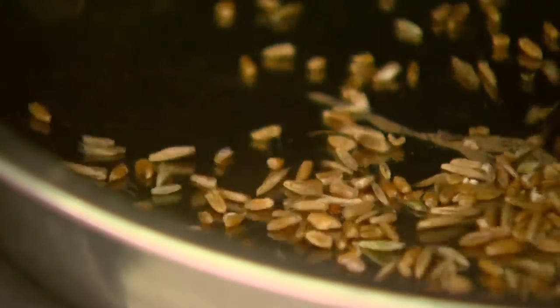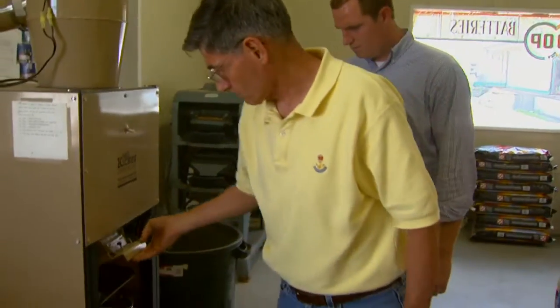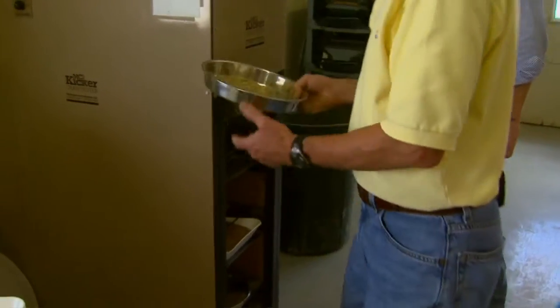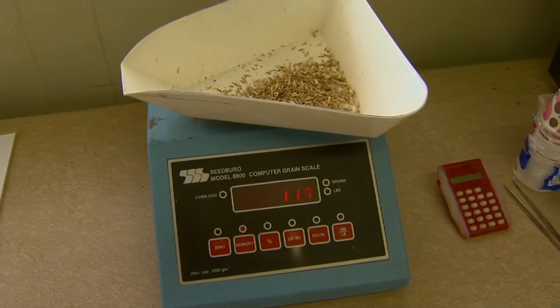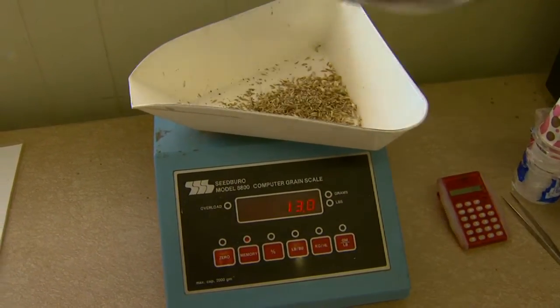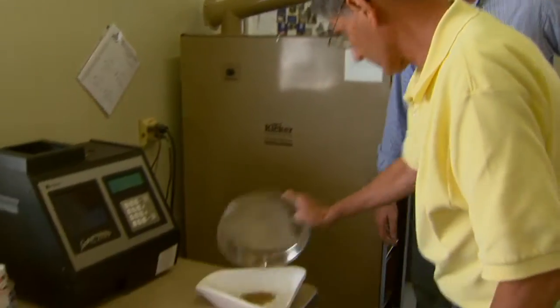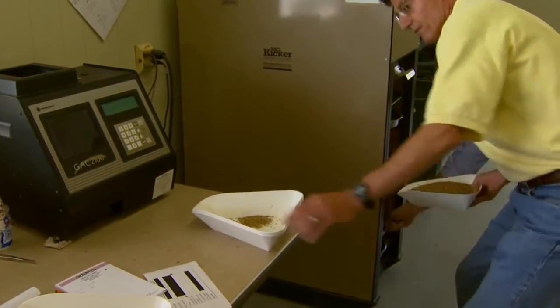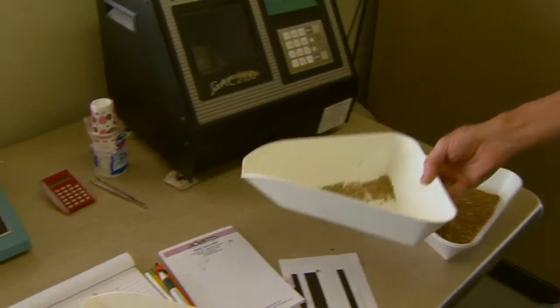That's the dockage. If you've got a cheat-y field with a lot of cheat, then that third pan down will be full of cheat rather than small wheat kernels — and that will also be dockage. So the third pan is dockage, and in this case the next pan has the shrunken and broken kernels. Now it's all separated and we have the clean wheat weight.